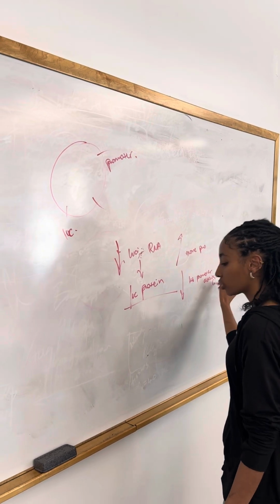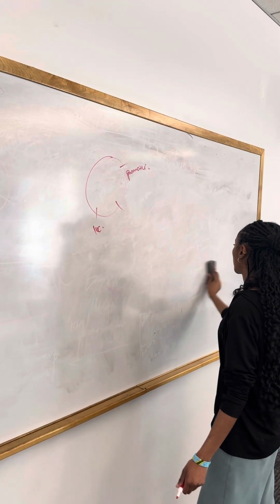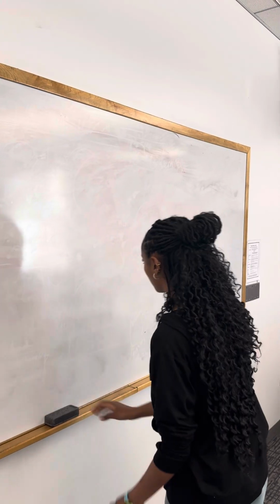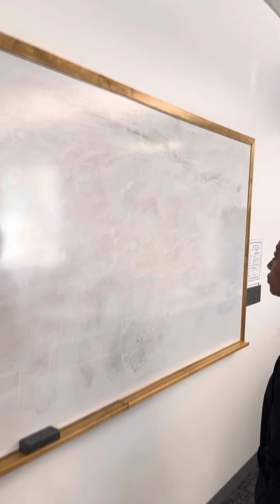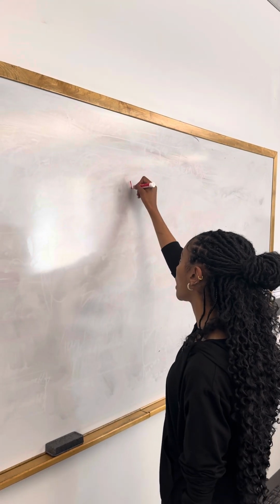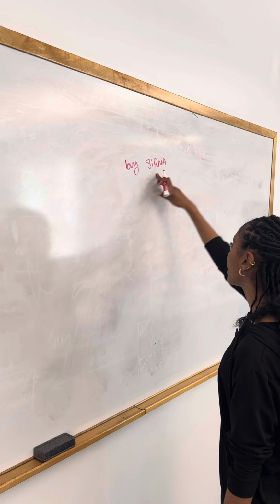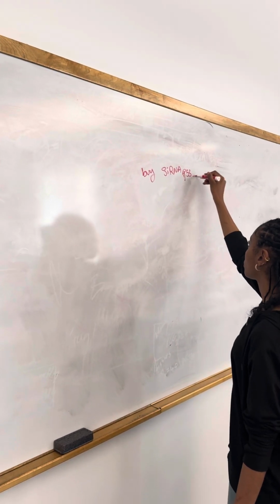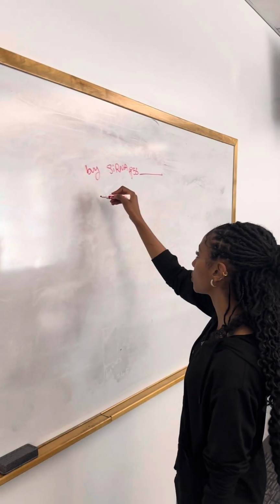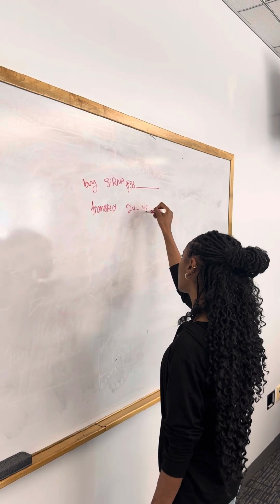Okay. So the last question was, what's gonna happen when there's no P53 basically. So when there's no P53, how are we gonna remove the P53 in the first place? So what we're gonna do is we're gonna buy siRNA against the P53. We're gonna buy that in base pair. So after we buy that, we're gonna transfect it into the cell. Wait 24 to 48 hours.